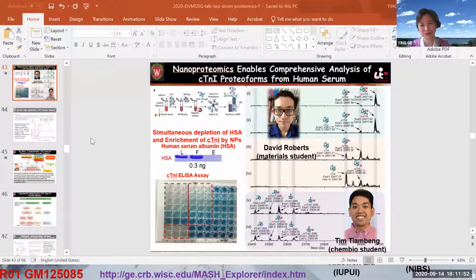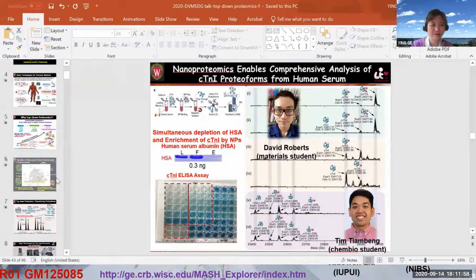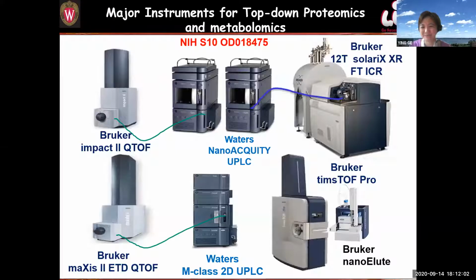For top-down, most of the data we collected is actually from QTOF. Honestly, our lower-end instrument was mostly used before the timsTOF joined.